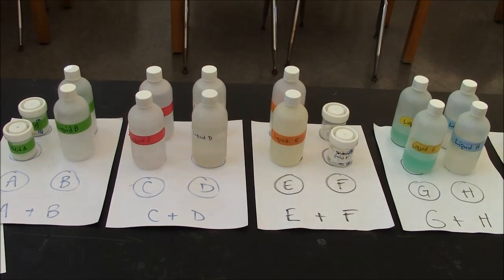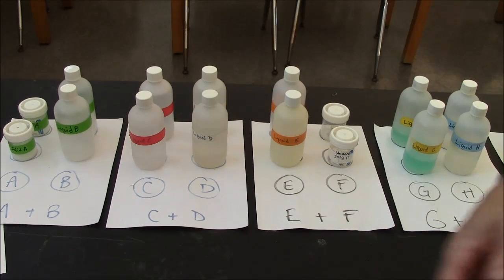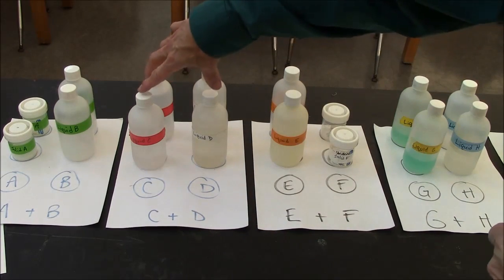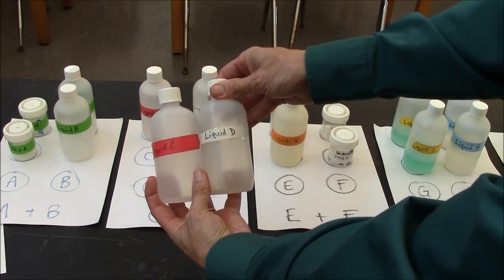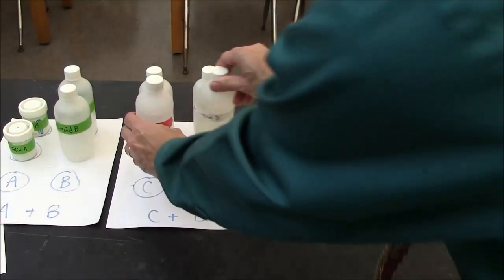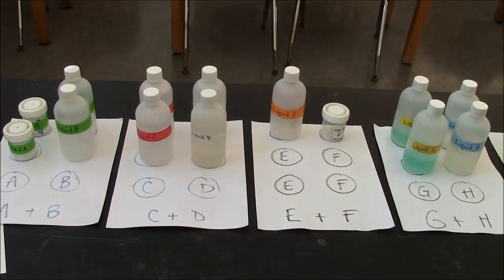The buffet table will have all the reagents you need nicely organized. Here you'll notice C and D. C is only used with D, so instead of grabbing one, you should grab both. Take them to your table, use them. Then, when you're done with that reaction, bring those back and get a new pair, for example, E and F.